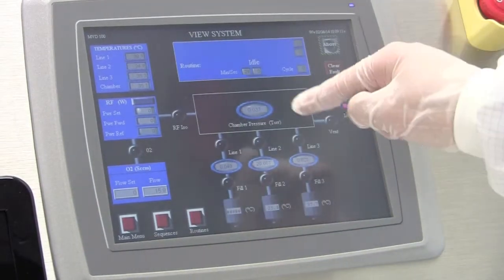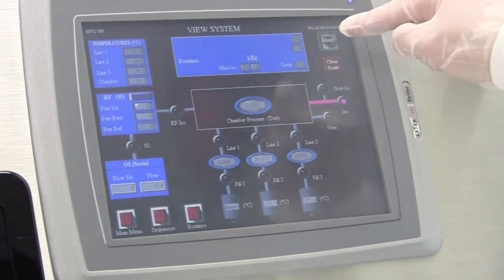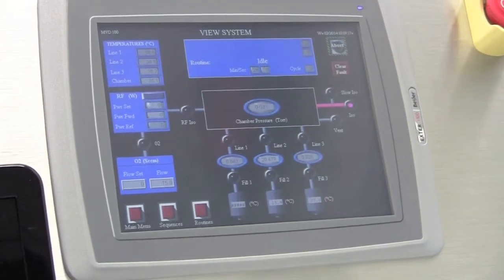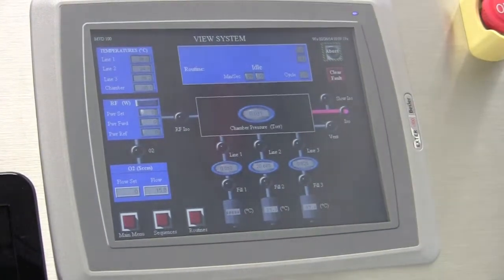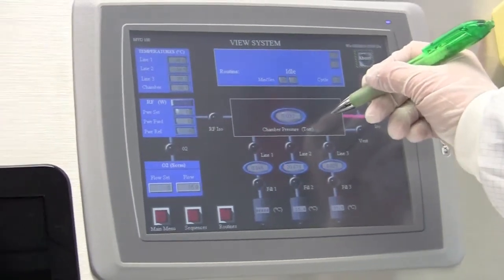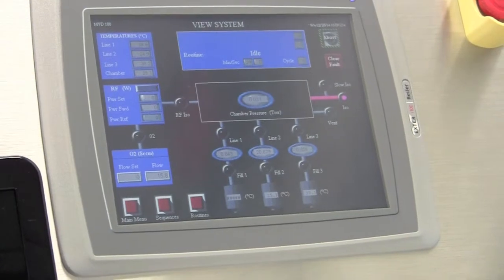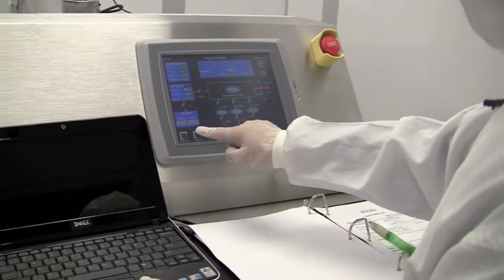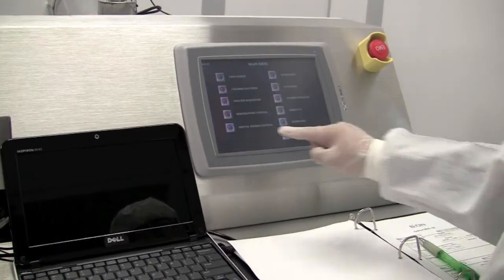We see that the system is under idle mode and the chamber is under vacuum, so everything is fine. So we need to write down the information of base pressure of the chamber here on the log sheet. And then we push main menu to come back.